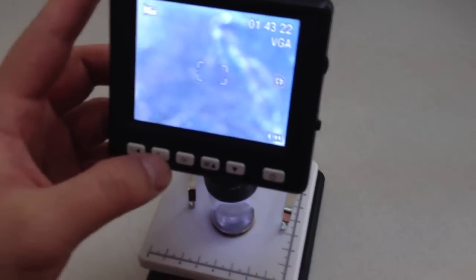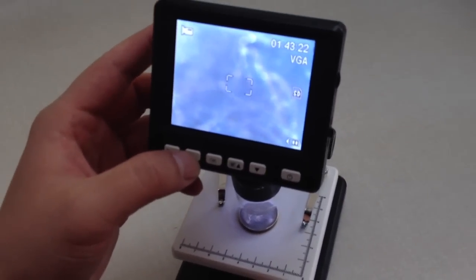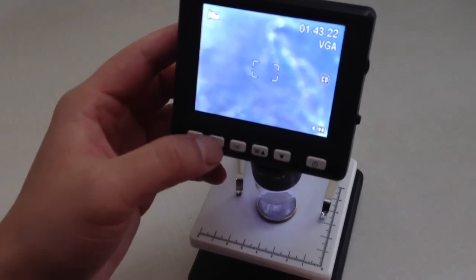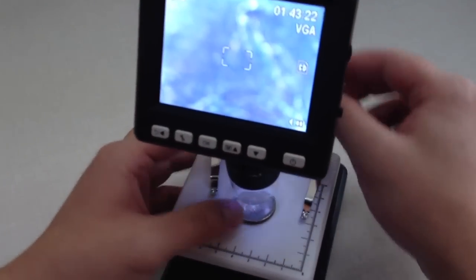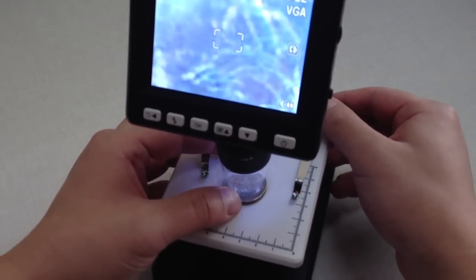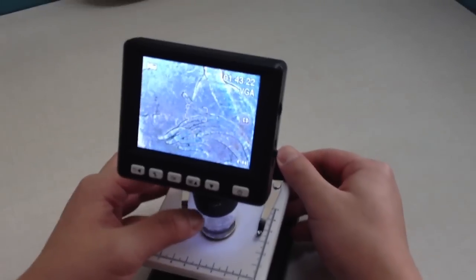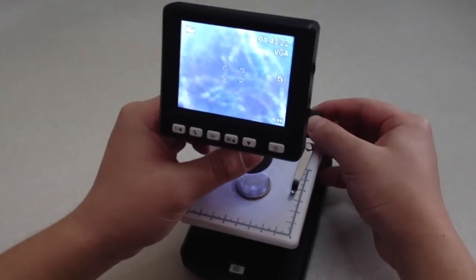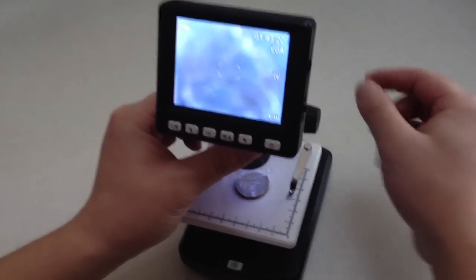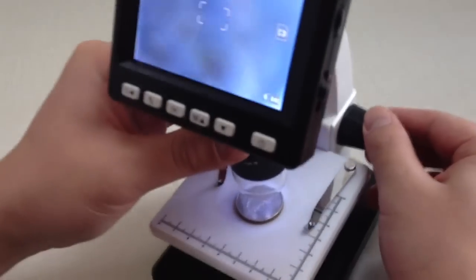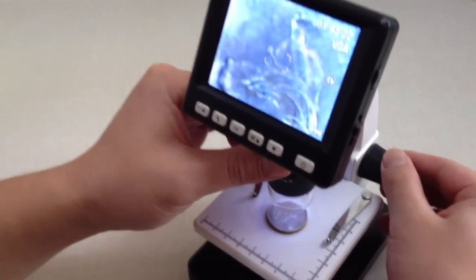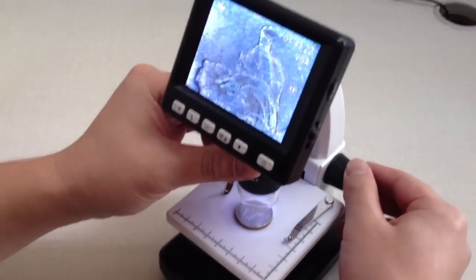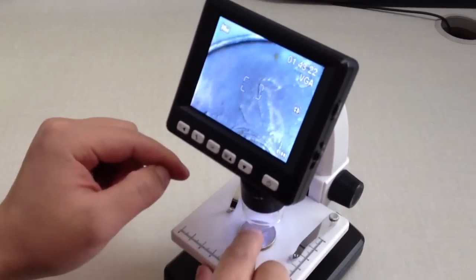The magnification is from 10 to 500 times. You can adjust it - make it small and adjust this rotation. This works, for example, with coins.